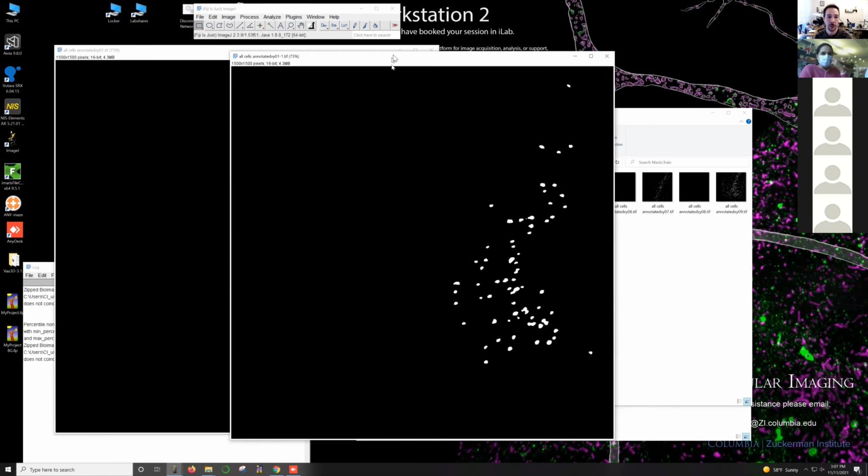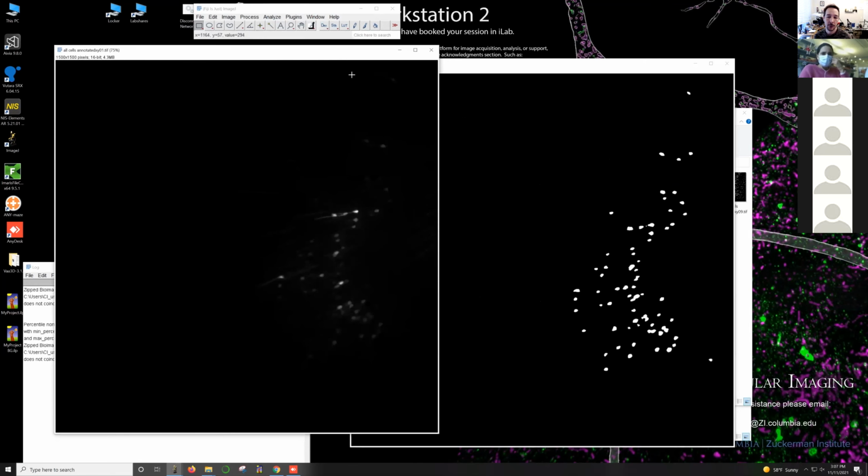So you could get these masks. This is where you have to spend a bit of time. You want to make sure that these masks are very accurate, because if there are any inaccuracies in them, that's going to flow through to how the network will interpret new data. So spending time here to really carefully annotate them will pay off.